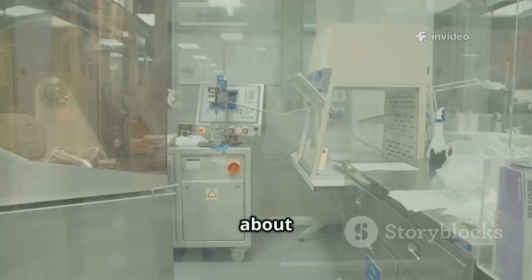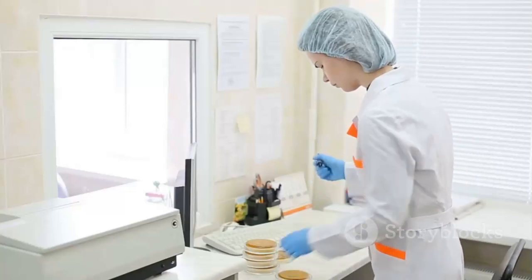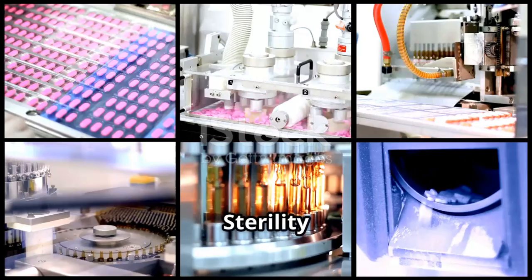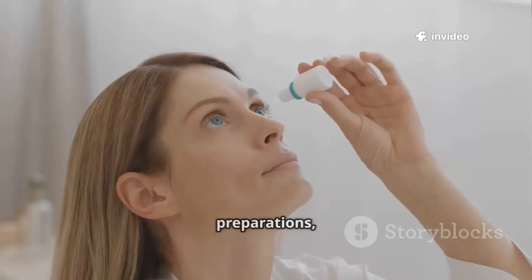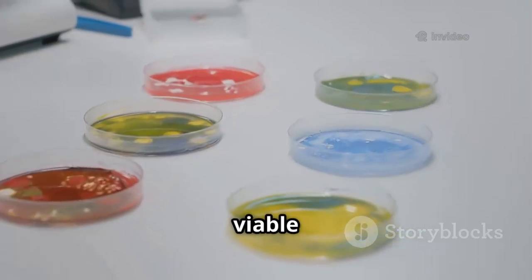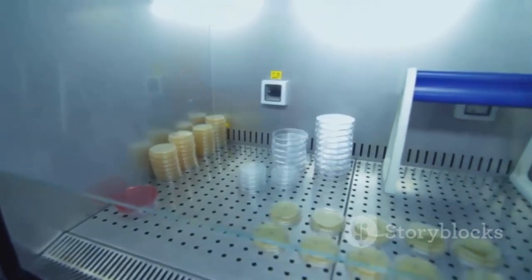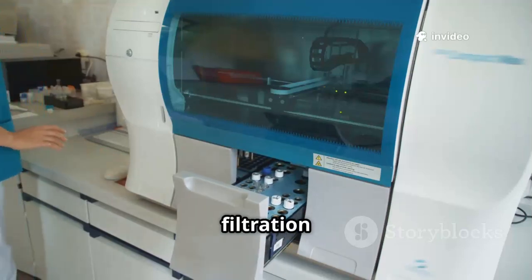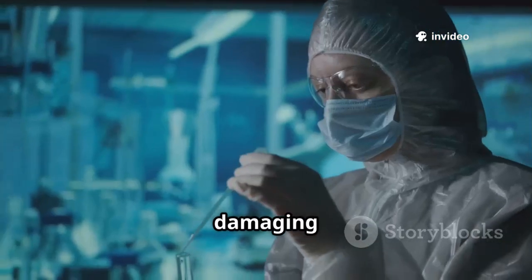Today, let us talk about one of the most critical quality control tests in pharmaceuticals, sterility testing. Sterility testing is essential for parenteral products, ophthalmic preparations, and surgical devices to ensure they are free from viable microorganisms. There are two main methods used. First, the membrane filtration method. This is used when the product can be filtered without damaging it.